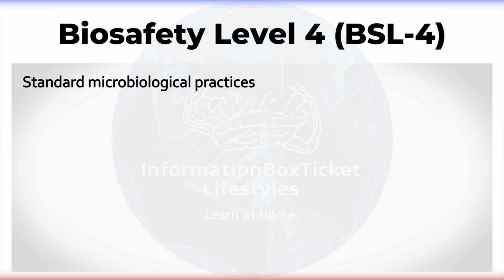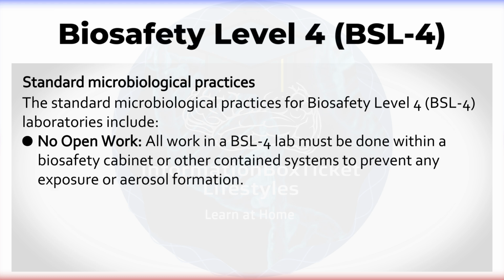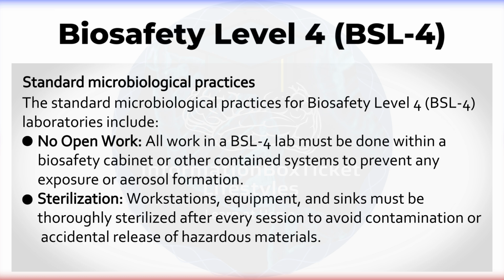Standard microbiological practices. The standard microbiological practices for Biosafety Level 4 laboratories include no open work. All work in a BSL-4 lab must be done within a biosafety cabinet or other contained systems to prevent any exposure or aerosol formation. Sterilization.